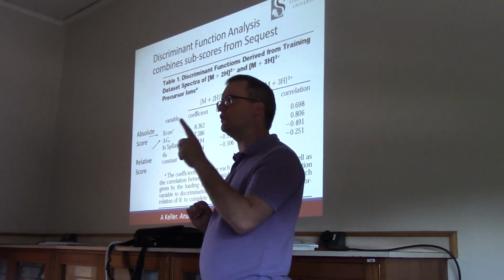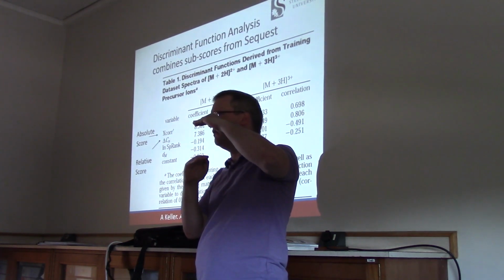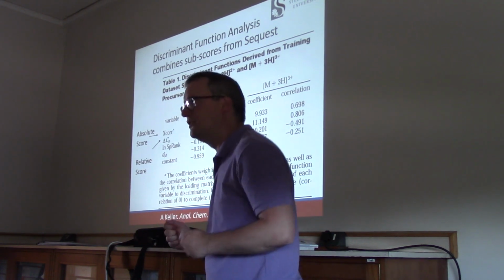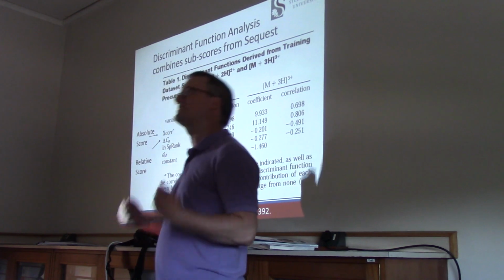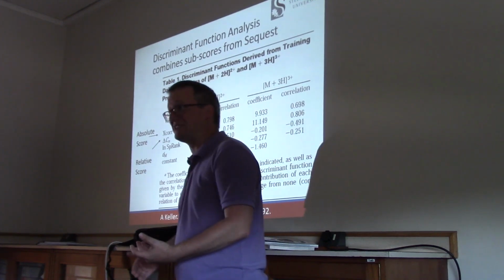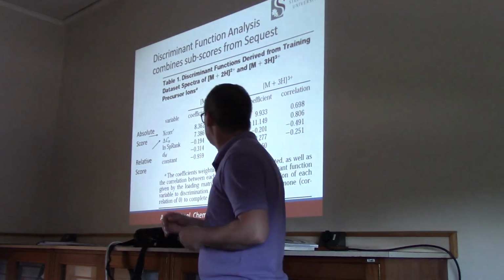Do you want that number to be high or low? Do you want the best score to stand out a lot from the pack or a little bit? A lot. Right? So if I'm running a 100-meter fastest man in the world challenge, I want to leave number 2 in the dust 5 seconds behind me. That would be impressive. If I'm 500ths of a second ahead of the next person, well, I still win. But that would be impressive to see me ever win a foot race. In any case, that's the interpretation of this Delta-CN score.